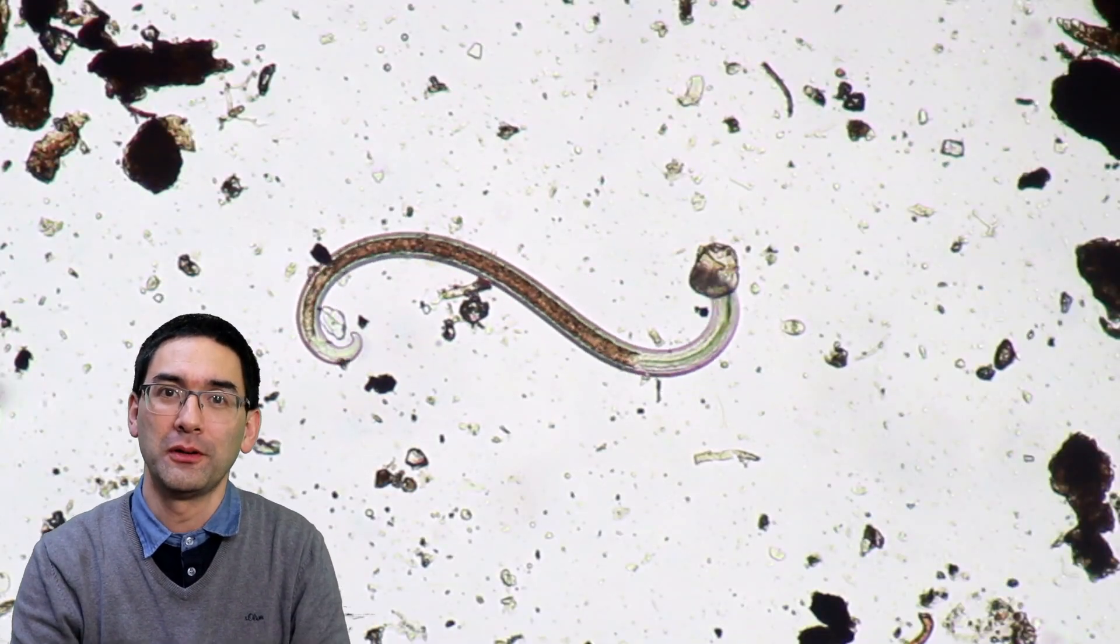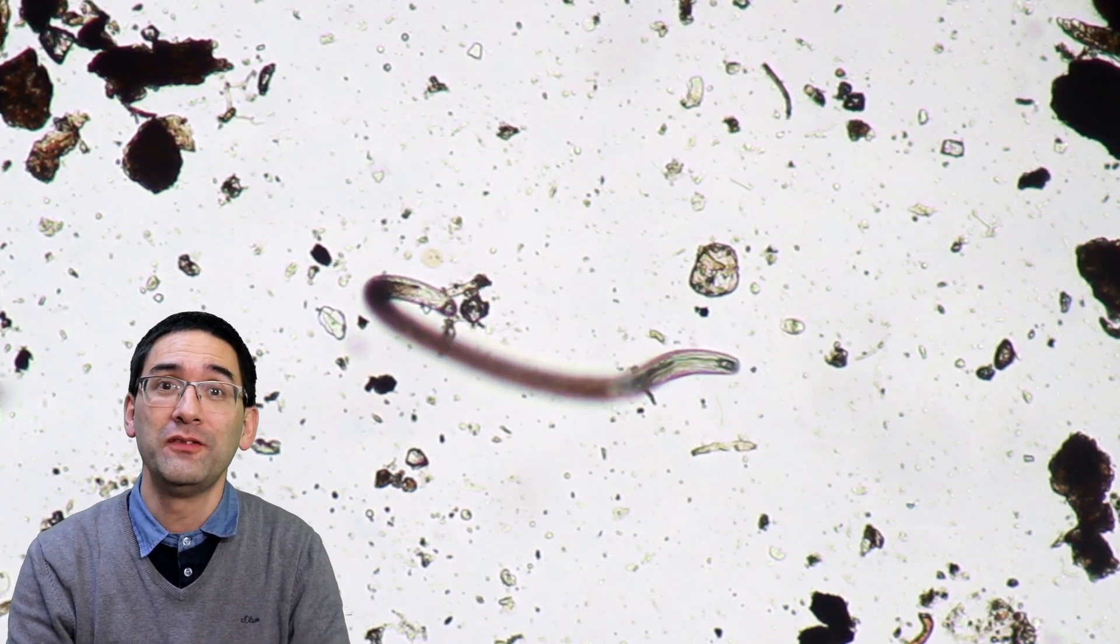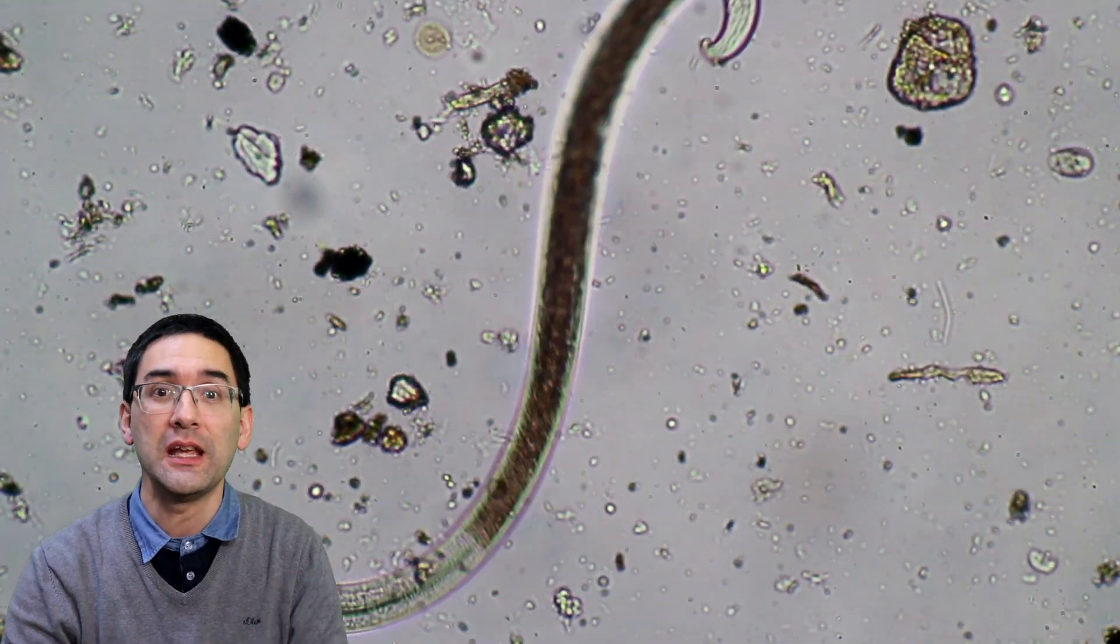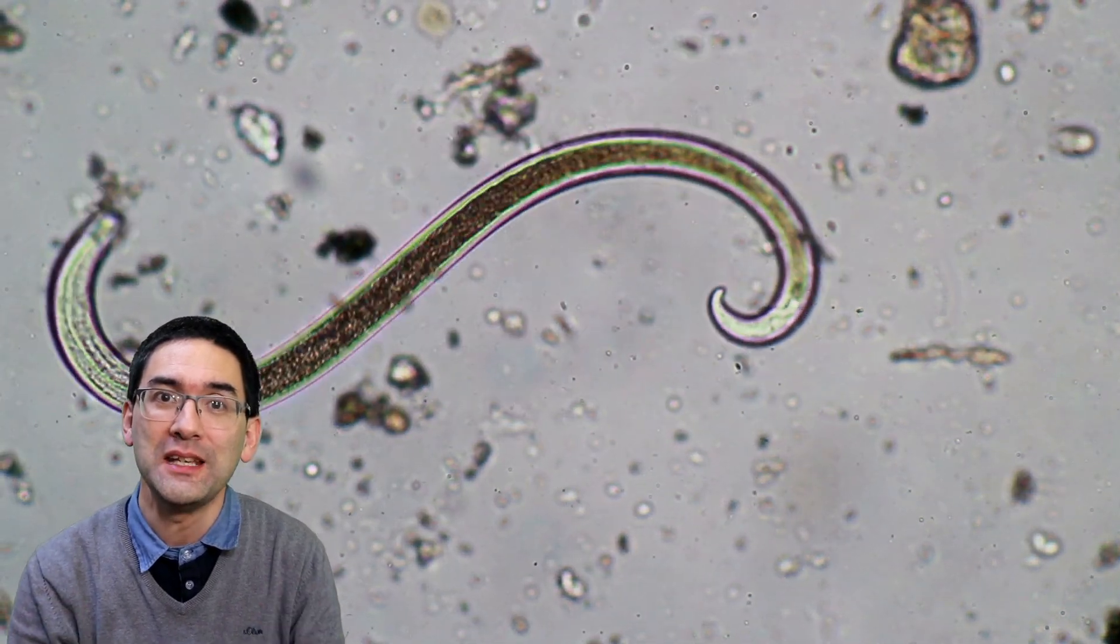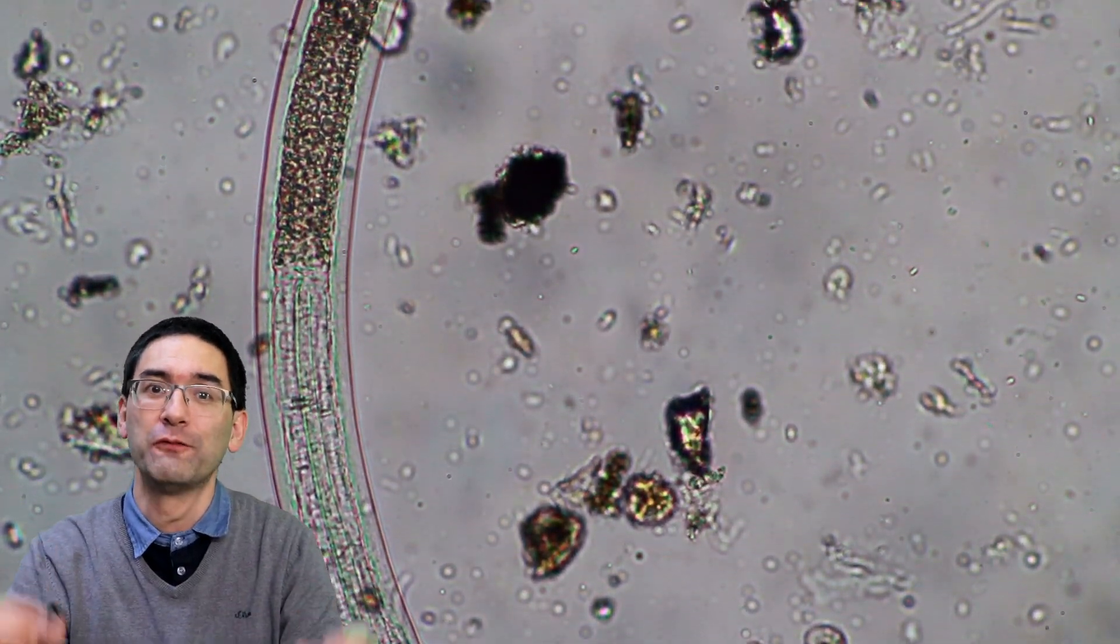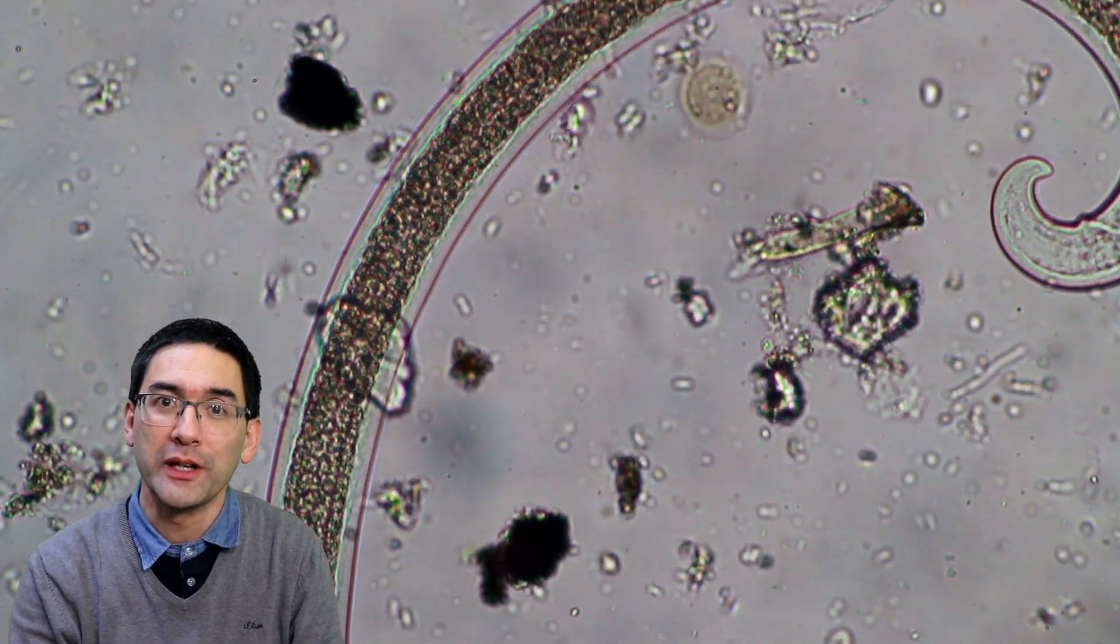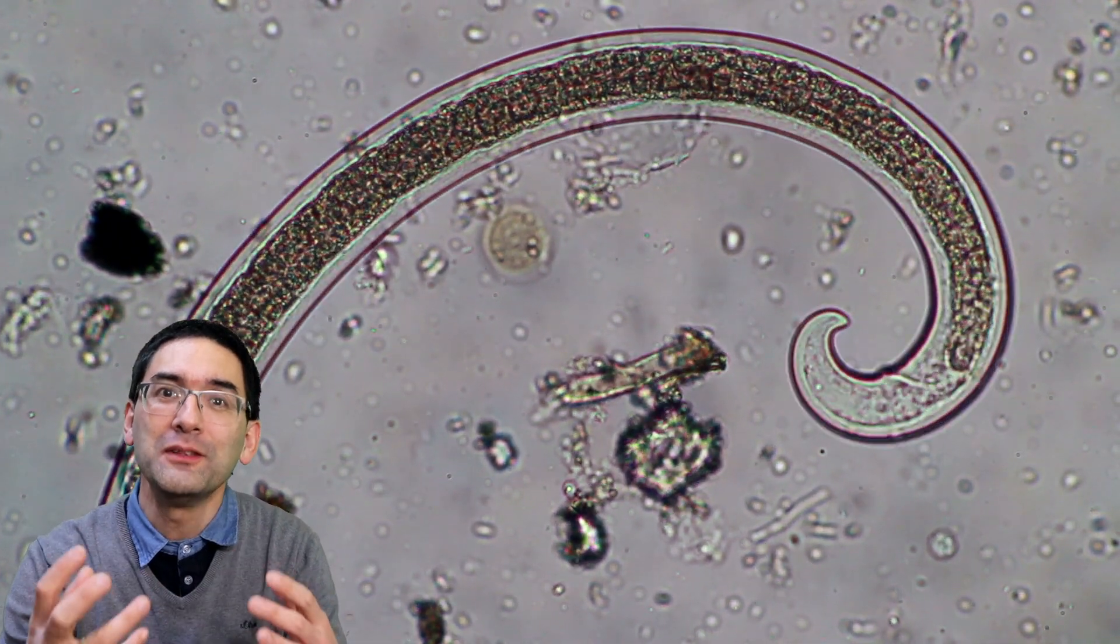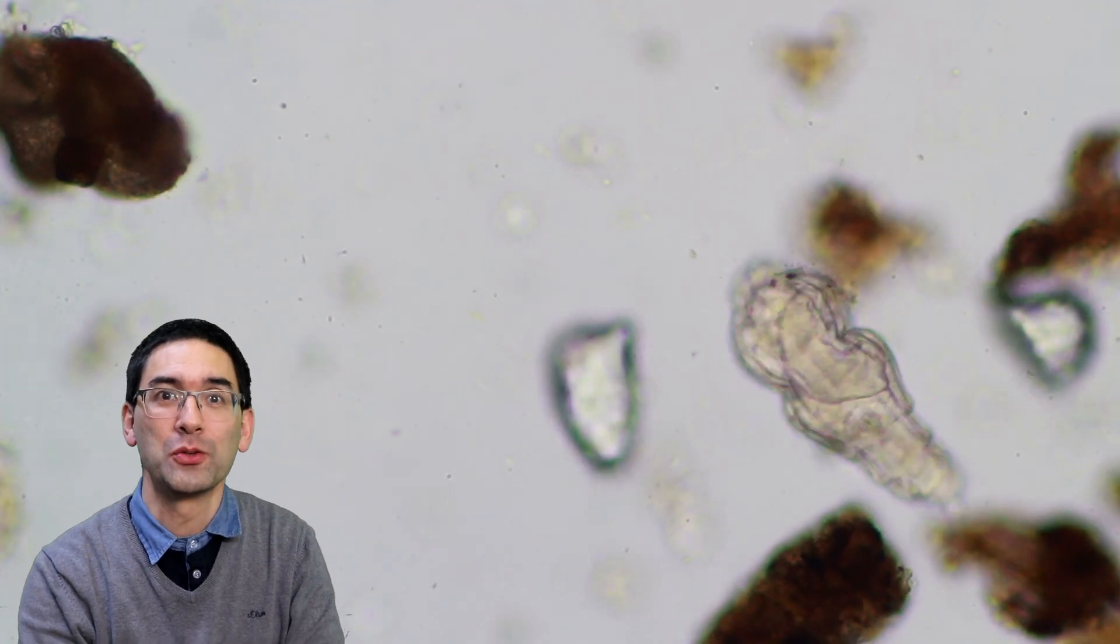I found this worm here. I have no idea which type it is, but it's a nematode for sure. In a recent video I showed you I found quite many of them in the moss and on decaying wood. The green color shows that maybe the worm has eaten some algae which have accumulated inside the digestive system. Here we're looking at it under greater magnification. It's quite fascinating to see the transparent nature of this organism.